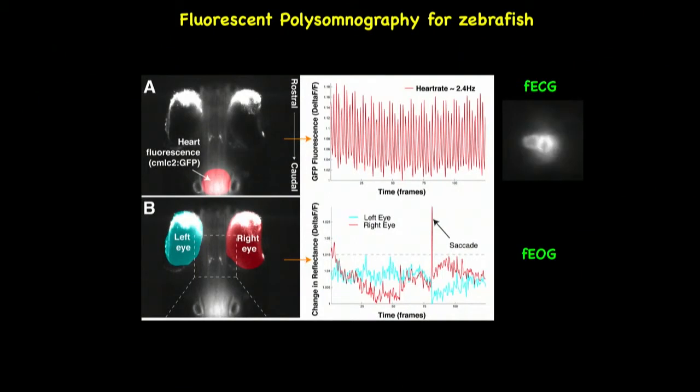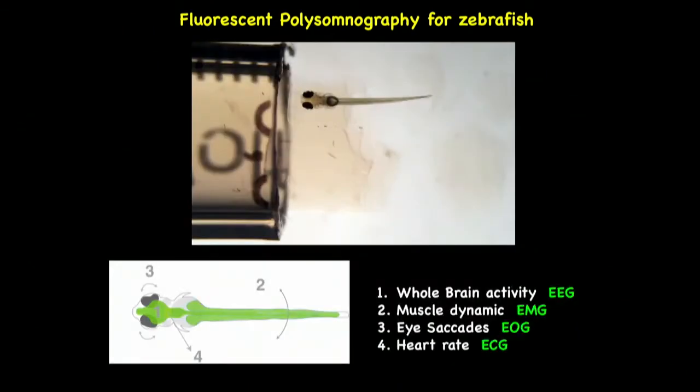The fish being transparent, you can record the heartbeat as well, as you can hear. It's a two-chamber heart, one ventricle, one atrium. You can record it easily, and you've got your fluorescent ECG. They have massive eyes that are autofluorescent, so under a scope, you can also record them and see the saccades. So you have your equivalent of EOG. This is nice: you've got a quintuple transgenic line to record all of this.